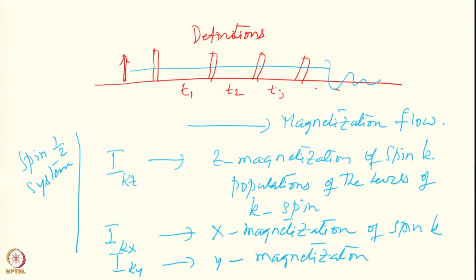Now among these, what is it that we observe? It is the transverse magnetization, right. We always measure transverse magnetization.